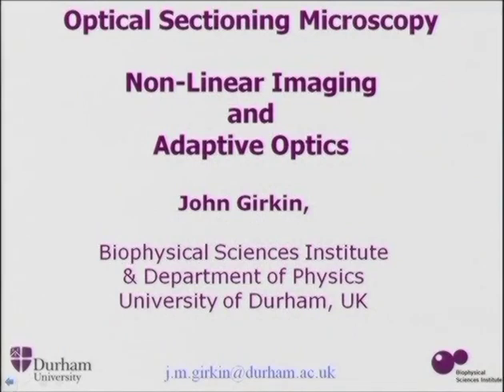What I'm going to do now is, I hope, going to answer 3 questions that people have asked me during intervals, both at lunchtime and yesterday afternoon as well. So it's taking what I did before and trying to push it a bit further and beginning to set things in a very clinical setting, particularly focusing on trying to do in vivo imaging. So there'll be some optical sectioning, as you'll see in a moment, and then nonlinear imaging.